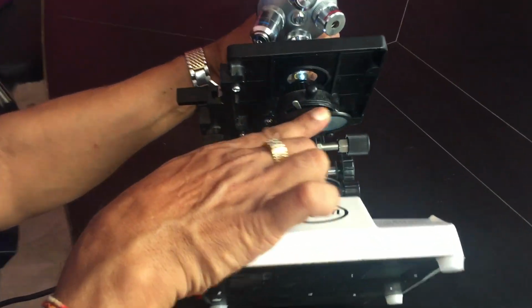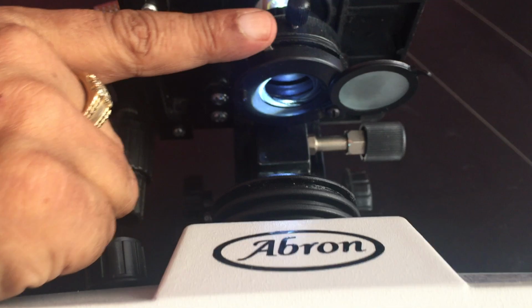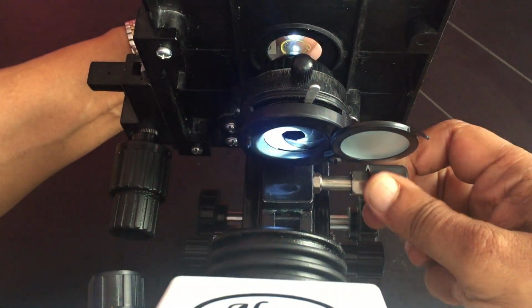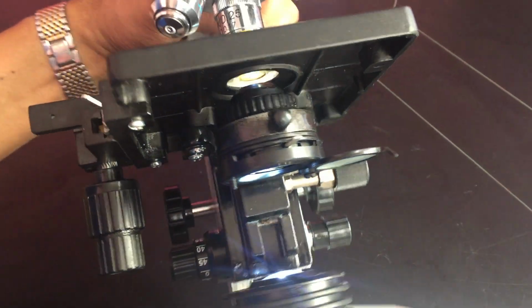You can put the filter, and then there is an iris diaphragm which changes the intensity of light, and there is this knob to make it go up and down. This condenser moves up and down. You make the optimum light.